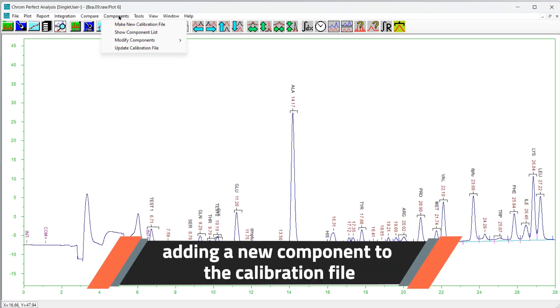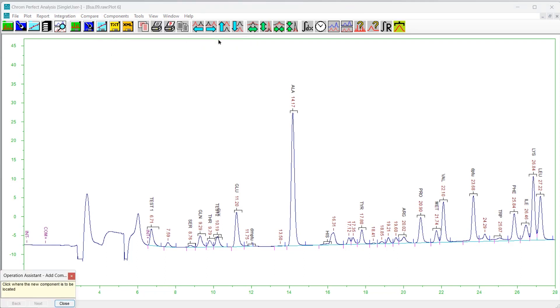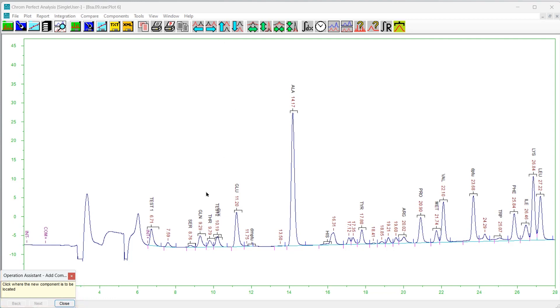To add a new component, choose Components, then Modify Components, then Add. The operation assistant form will appear. Click on the chromatogram plot where the new component should appear. If you click within a peak, the new component will be centered over the peak top. You will have an opportunity to modify this position.